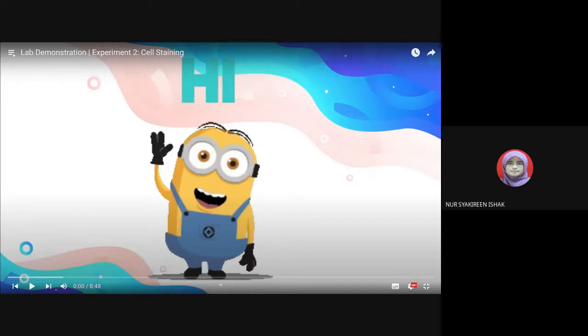And then the result part. For the result part of this experiment, I want you to draw the observation. You have to draw the cell observed under 3 magnifications, which is 4 times magnification, 10 times magnification, and also 40 times magnification. So you have to draw, for each animal and plant cell, 3 drawings under 3 different magnifications.